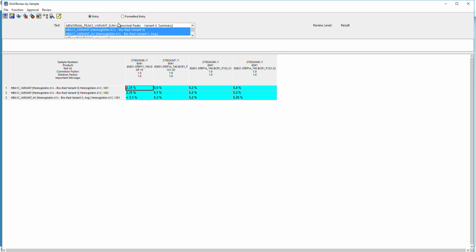And when you're clicking back and forth, it'll also take the rounding out if there's any rounding. So you can see here it's showing 5.35 for the result here. So this is how this functions.